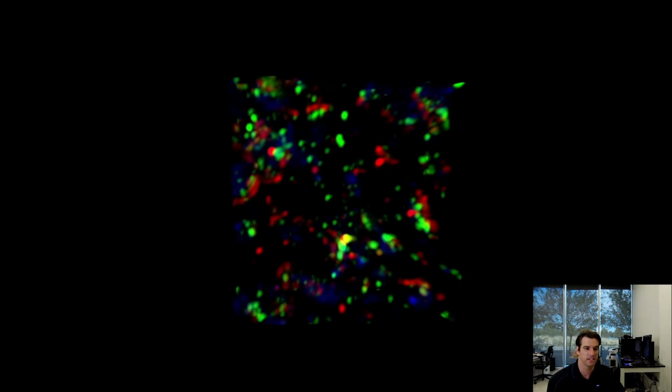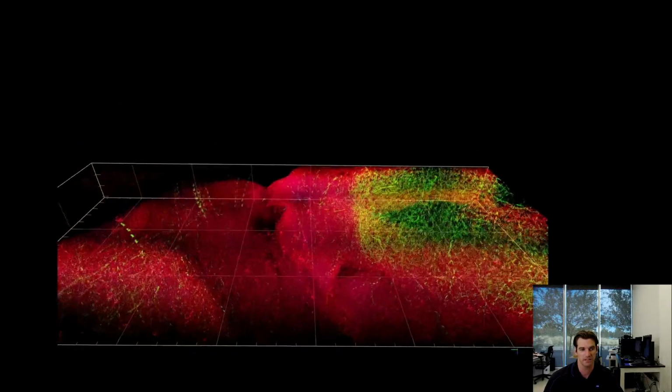Okay, so I'm going to let this play, and I will drop in, this is a pixelated version because I'm going to show the data set that we collected on the lattice light sheet when we got this sample in our hands. And this will zoom out and out. And so what they were able to do on the inverted microscope was the best Z-stack that they were able to get after trying a number of inverted systems. And now we're looking at this section.